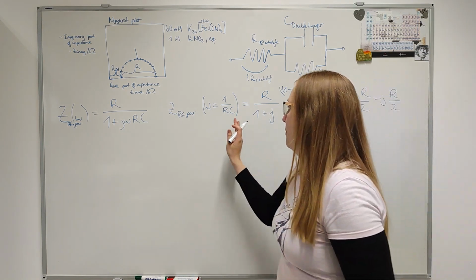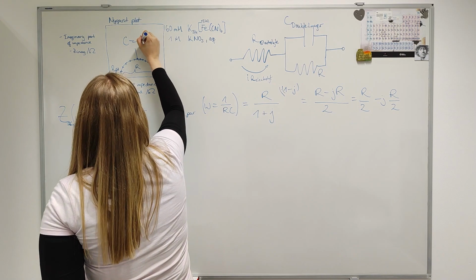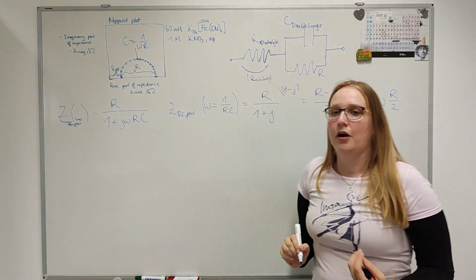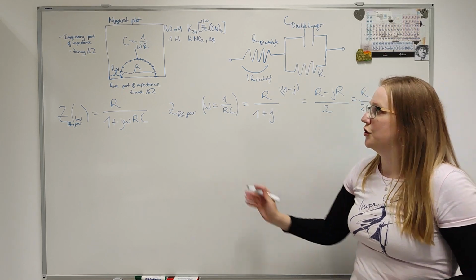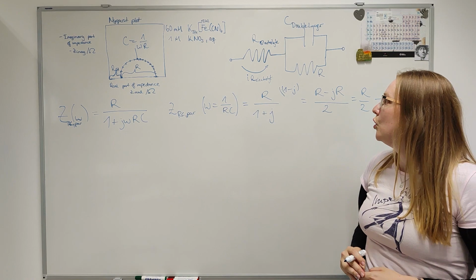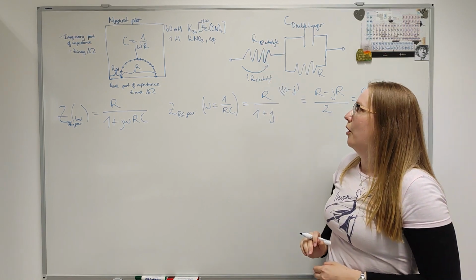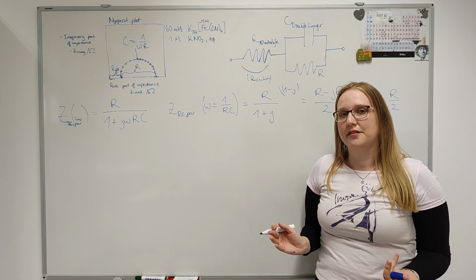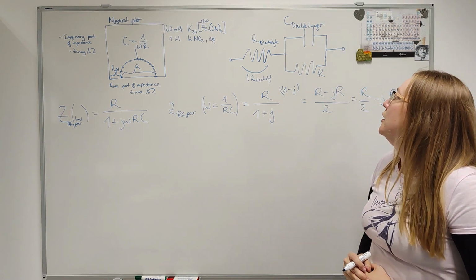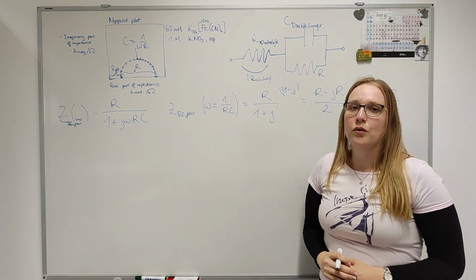And if we now rearrange this term for the capacitance, we see that we arrived at a simple way to determine our double layer capacitance just from the impedance spectrum of our redox pair. So we found an interpretation for our ohmic resistor as electrolyte resistance, and we learned how we could calculate the double layer capacitance of our system in this easy case.